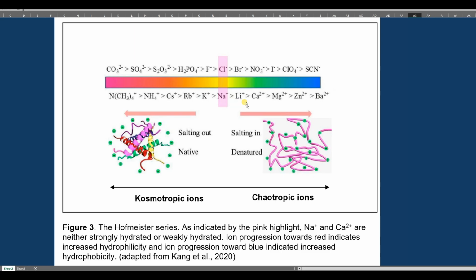But again, if we look at calcium, magnesium, and zinc, all these things are additive packages to oil. As they go up, they become, well, we're just going to say they're more reactive, so to speak. That's what everybody says, and that's the practical way to say it, but it's not the real term. But anyway, calcium, magnesium, and zinc are much more reactive.